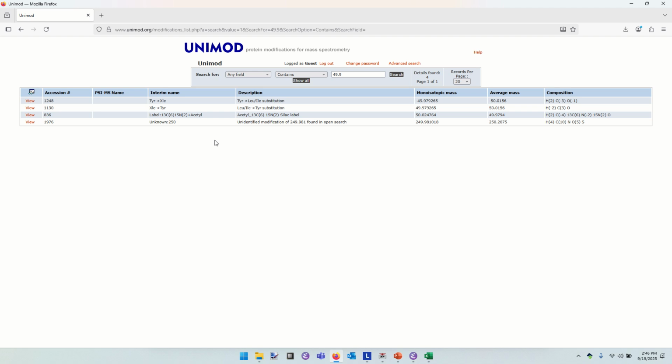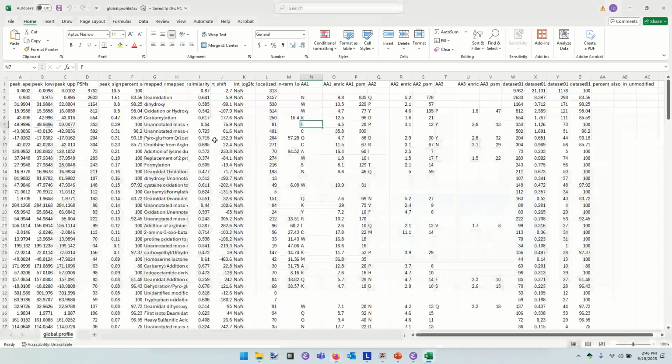That's not a limitation our peptides are under. They may have multiple modifications that add up to that mass as well. And if the plus 50 we saw is coming from a protein with oodles and oodles of copies, then it may just be giving us a lot of evidence over and over again for the same sequence being modified in this way. Okay. So, yes, sir.